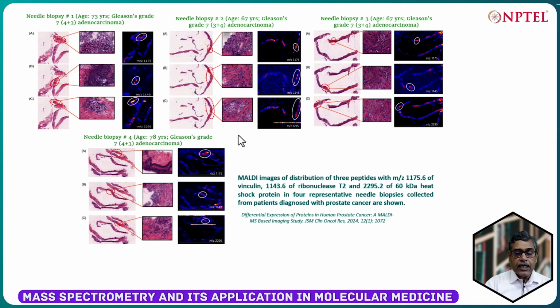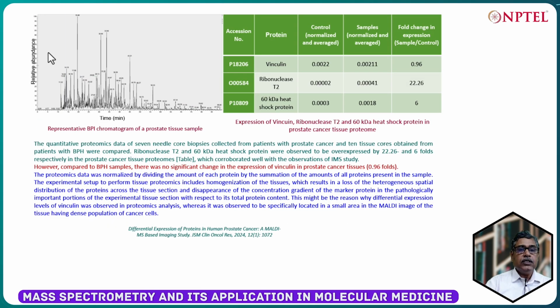Now, I will end the class by talking about proteomics findings. We have discussed identification and characterization, but now I will be talking about quantitative proteomics, quantitative tissue proteomics. This is the beautiful chromatogram obtained from nano-LC, which represents different peptides that have come out, nano-LC ESI-MS that was used to characterize protein, identify it and to quantify it.